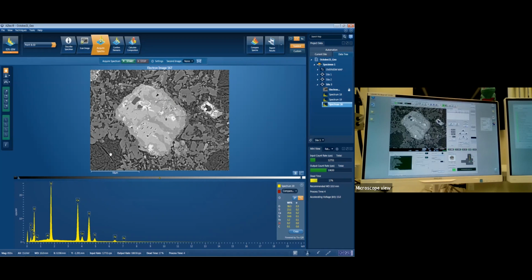It's the same way that when they're making tarmac for roads, they use a range of rock chippings. They don't just use one type of rock, because that would all just rub down at the same time and ruin a road. Same sort of thing happens here. We have a range of minerals with different hardnesses. Some rocks are actually really hard to get flat enough to put into an SEM, to do EDS and backscatter, just because the minerals keep falling out, which is something to be aware of in sample prep, as sometimes the rock can just fall apart on you. But we're pretty good at not letting that happen these days.